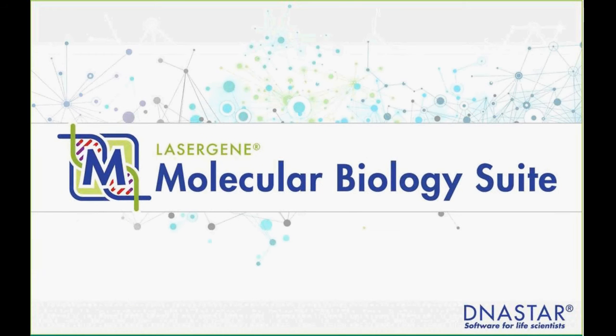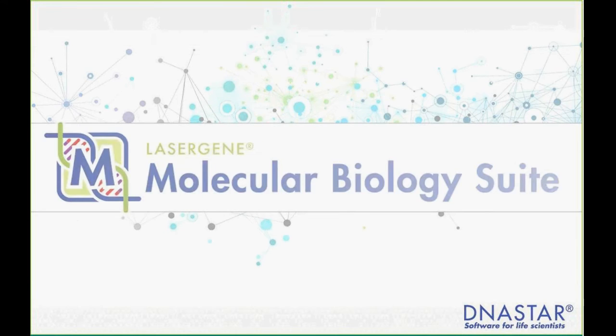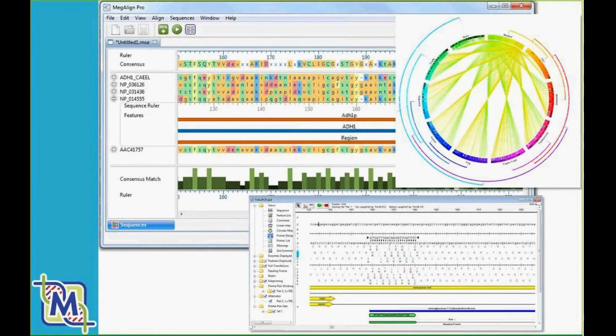And so the molecular biology suite, I'll just give you a brief rundown of what we have here. These include all different tools like sequence editing and multiple sequence alignment. We have tools for Sanger data analysis. This is a set of software programs that has been available for over 30 years at DNASTAR, so this is part of all of our packages. If you have NGS needs plus some basic needs, we can cover all those different functionalities.